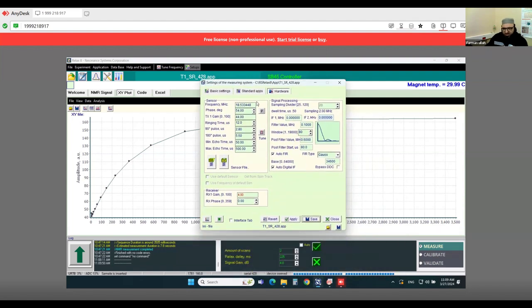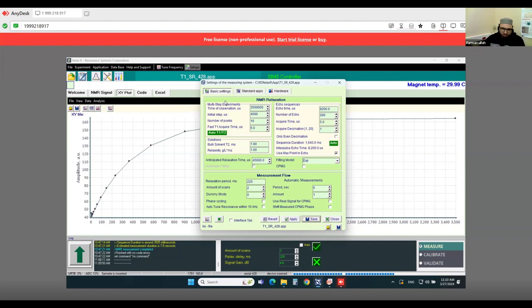Last time, someone delivered a lecture about setting these parameters, which is very useful, and I will also repeat some things and show you some things. Here we have to take care of the units. The first thing is to take care of units, because if, for example, my observation time is 3 seconds, but here it is written in microseconds, you must take care of these things. Here also you see microseconds.